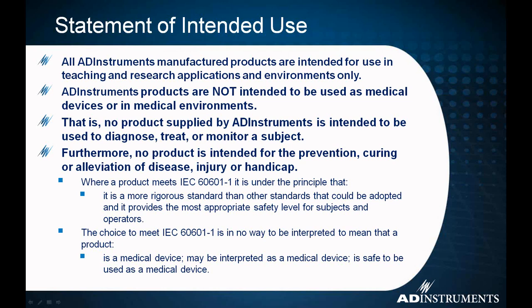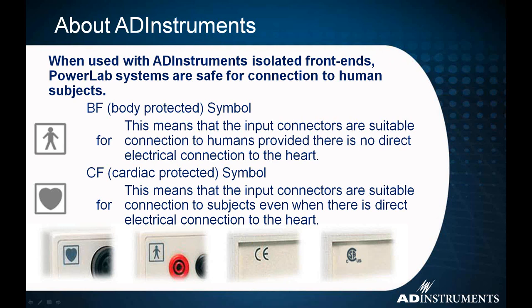Also, a little bit of boilerplate here. We quite often get this question from customers: how can I use my LabChart and the PowerLab? What can I connect it to? What are the limitations? You don't have to read all of this, but the take-home message is that our products are not medical devices. They cannot be used to diagnose, treat, or monitor a subject. That's the big take-home message from everything mentioned here: they cannot be used for diagnosis, treatment, or monitoring.